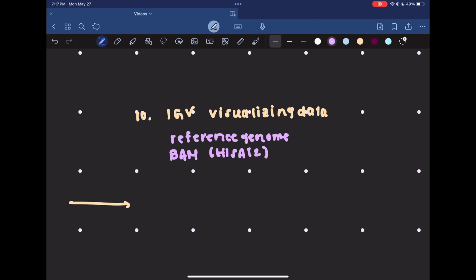It also gives you an idea of the transcription, how frequently something is transcribed, because you can visually see how much it's transcribed. And you can also input the GTF files from StringTie, which gives you that overall look at, based on the reads and the alignment, what the transcripts might look like.